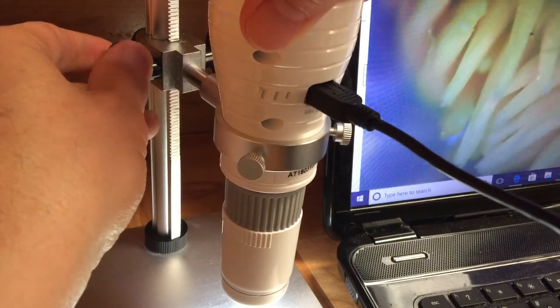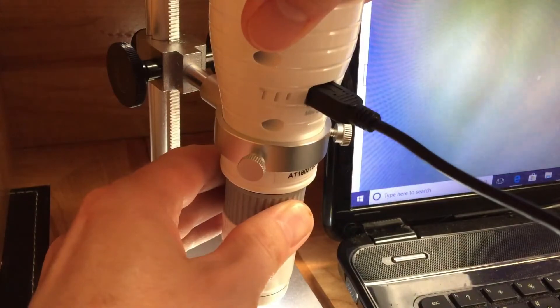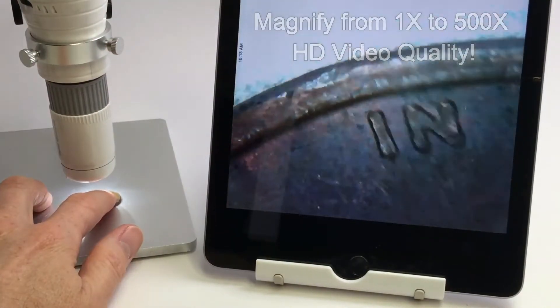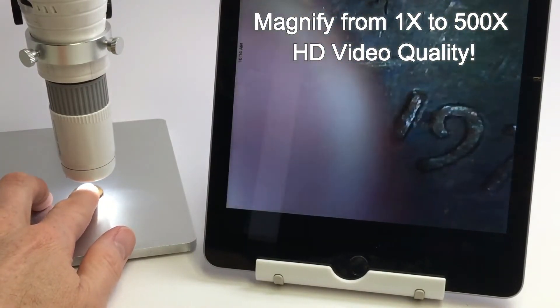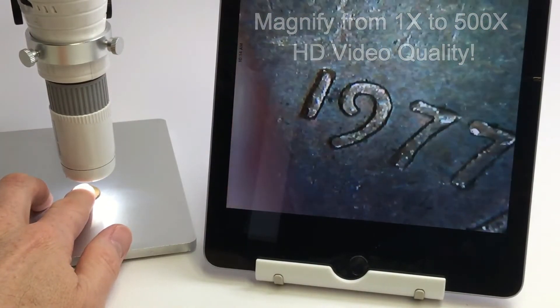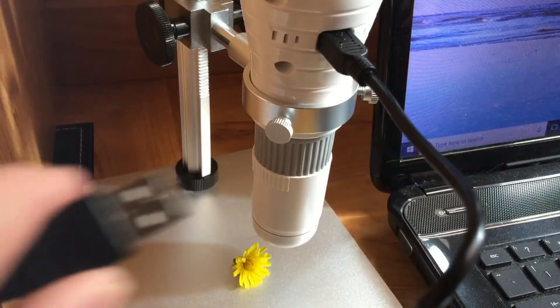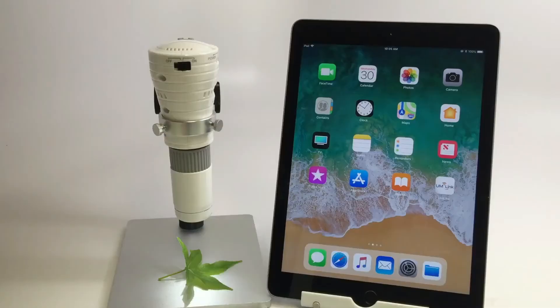The microscope is operated by adjusting the camera's height and using the focus wheel to bring your subject into focus. Maximum magnification is 500 times and supports HD video quality on your device. The UM520 can be charged by connecting the included USB cord and charging through a PC's USB port or charger block.